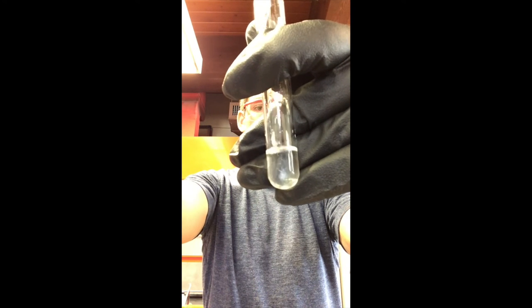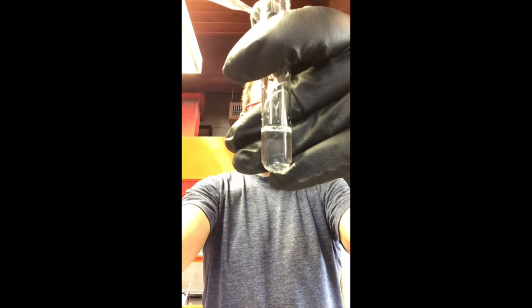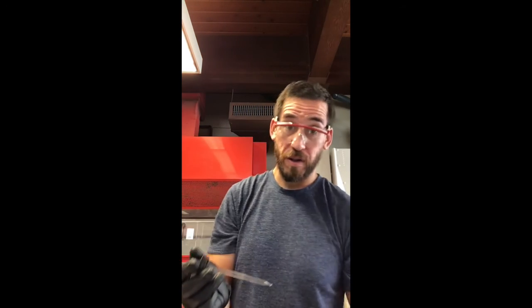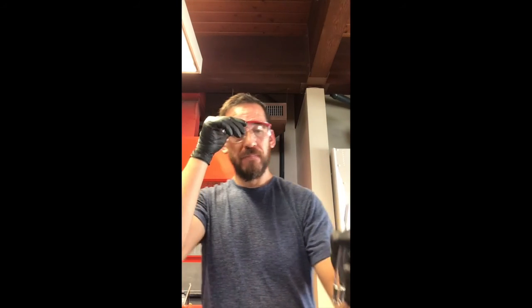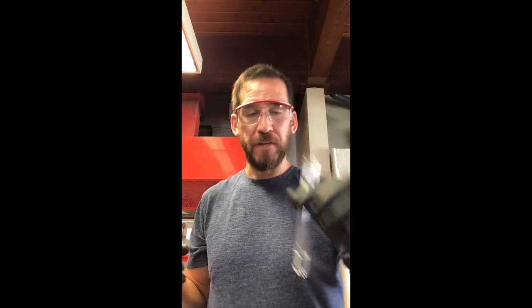Now I'm going to squirt a bunch in there. It's like turbulence almost, like it's smoking in there, but not really. I don't know how to describe it. I would call them swirling lines. There is a German word for it. I totally forget what it is. But in the end, we've got one layer. So the two are miscible with one another, and they mix fine.